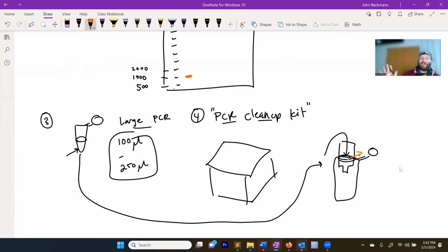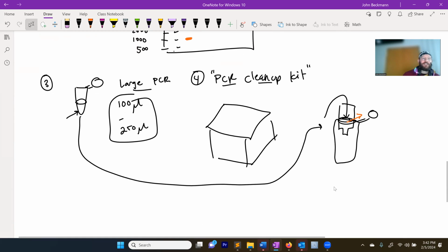So far, we have not done anything with plasmid, not touched any plasmid yet. We've just set up a PCR reaction. So what was in that PCR reaction? Yeah, remember, so there's buffer, there's water. What else is in that? There's a polymerase, probably a high fidelity one. There's dNTPs. There is template DNA, which you definitely want to get rid of, where the gene actually came from. And then there is the, what's missing? Buffer, water, polymerase, dNTPs, template, primers.